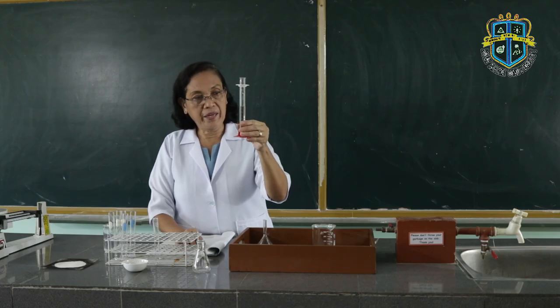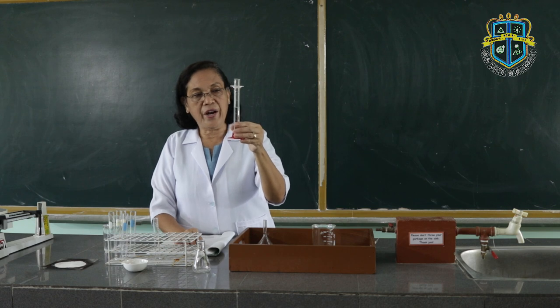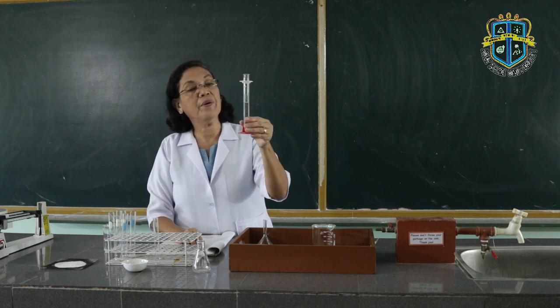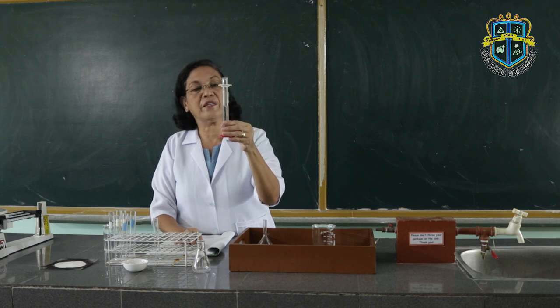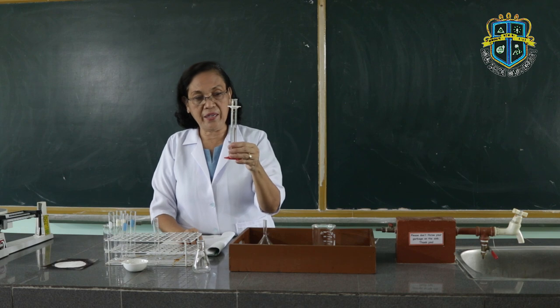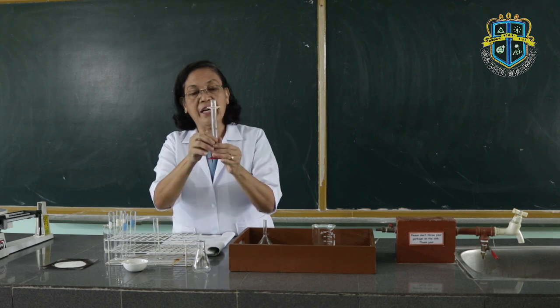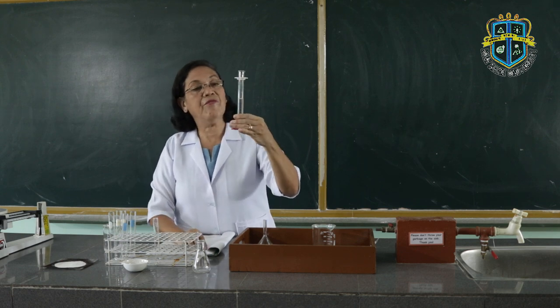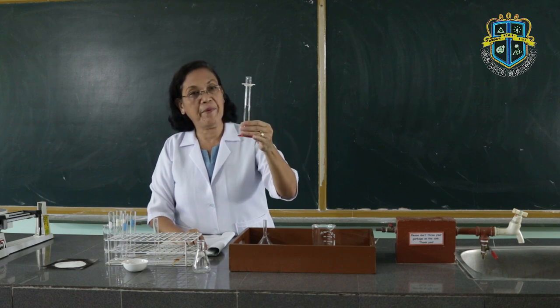Because this is only water, we are going to look at the lower meniscus of the volume reading. However, if this were mercury, then we are going to look at the upper meniscus of the liquid. In this case, the volume reading is 17 ml.